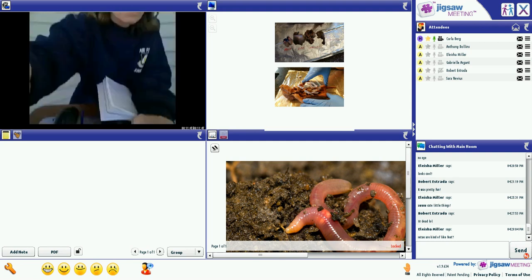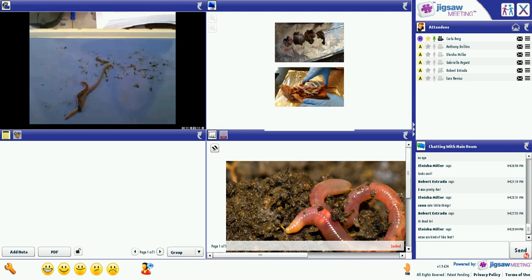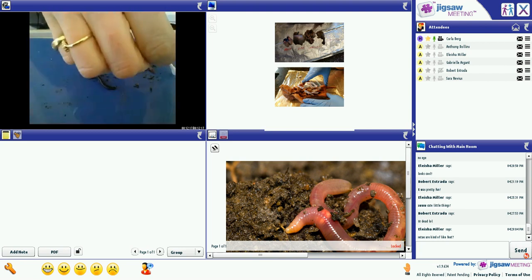All right, then I'm going to move my camera back and move my worms back. And I'm going to put a vinegar line in front of them, and I'm going to see what they do. Okay, this worm got to my vinegar line and turned away. Let's try it again.